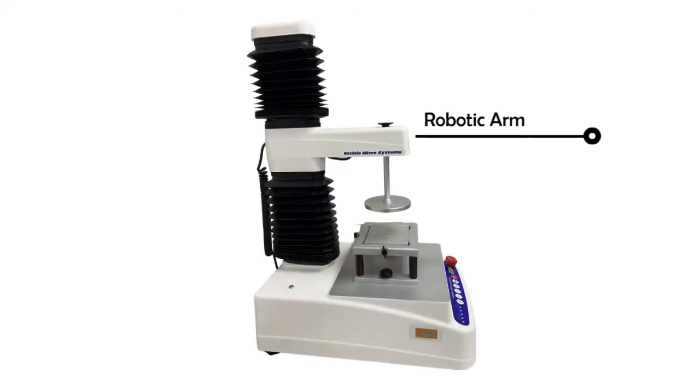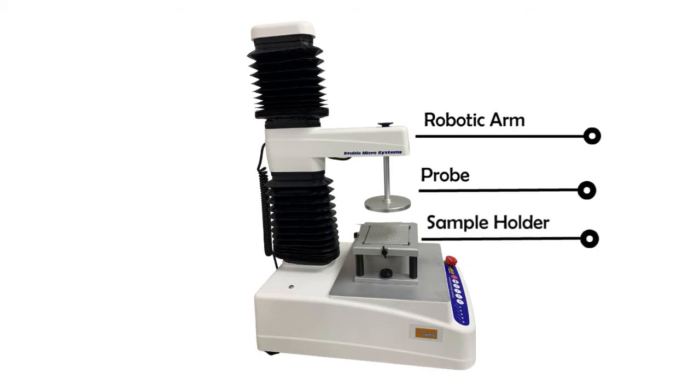The equipment consists of a robotic arm that regulates the force applied to the sample. A specific probe is attached to this arm according to the rheological property to be evaluated. Additionally, it has a sample holder platform in which the interaction of the probe with the sample takes place to obtain an analytical signal, expressed as a penetration force curve or compression deformation force curve, for a predefined travel distance per unit of time.